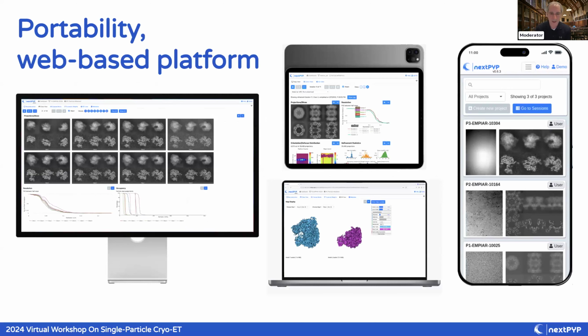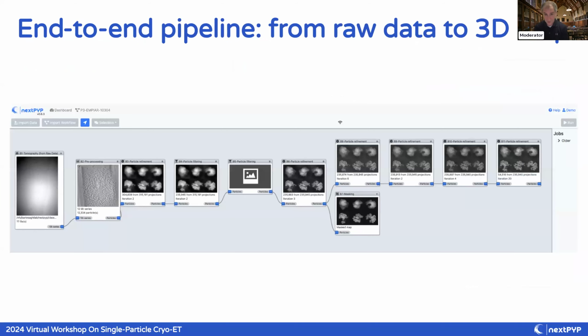So, portability. I think everybody can acknowledge what web browsers can actually do today, the powerful applications that you can run, and just the convenience of being able to access this application from any device that you have available. At least for us, it has really made a change in the way we interact with data processing, and also with getting feedback during data collection.